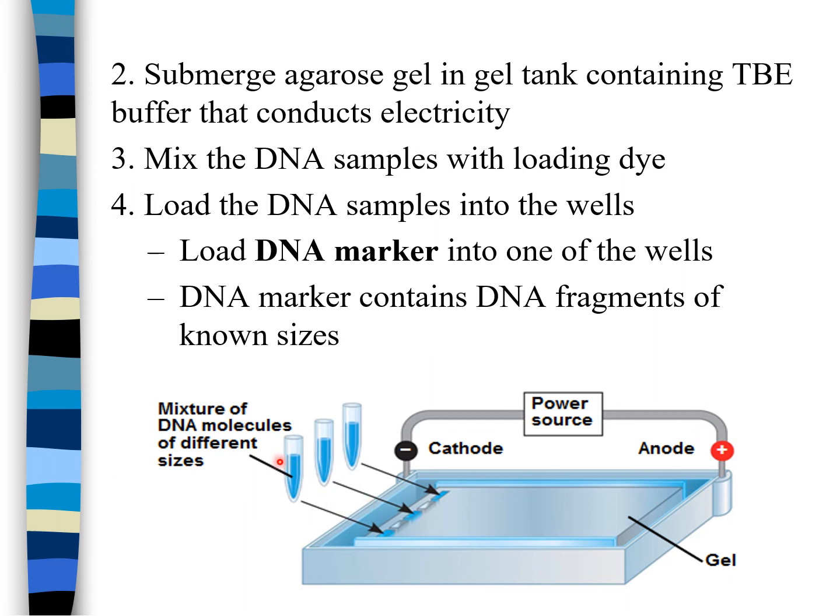And notice here, one of the samples is a DNA marker. I'll show you guys what a DNA marker is. So you always have to have a hole containing a DNA marker, or a DNA ladder. DNA ladder, that's another word for it.